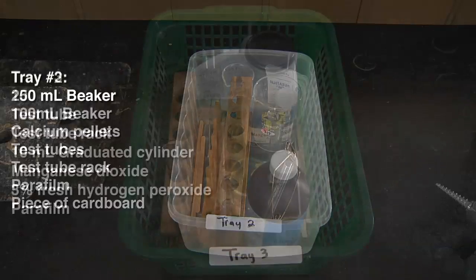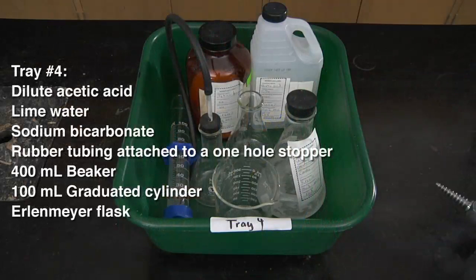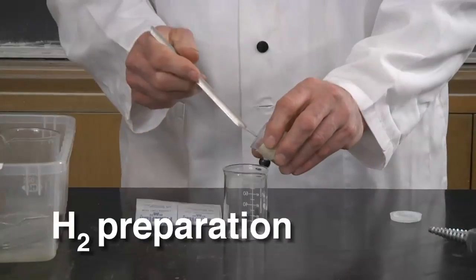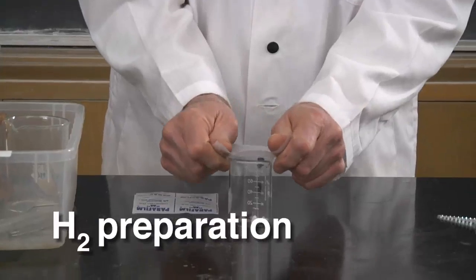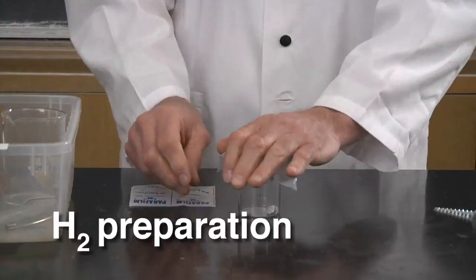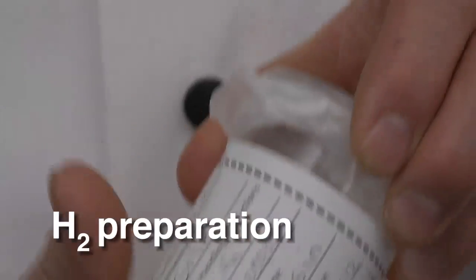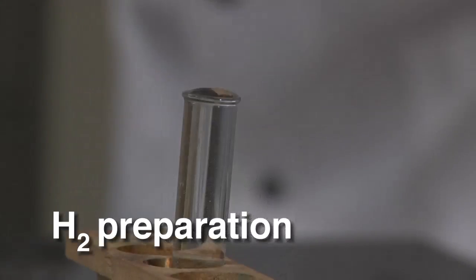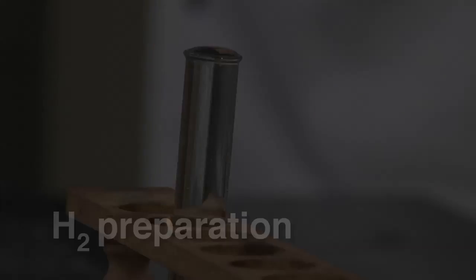The stock containers are not for use in the classroom, but for preparing for the student investigation, and should be removed before students enter the classroom. Use a clean, dry spatula to select pieces of calcium for the investigation. The test tube, filled with water, will collect the hydrogen gas produced.